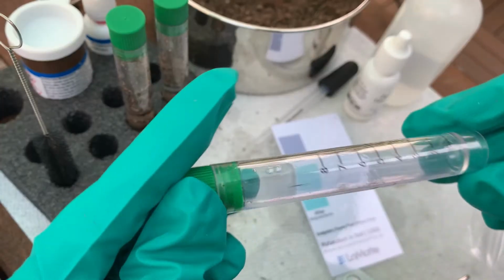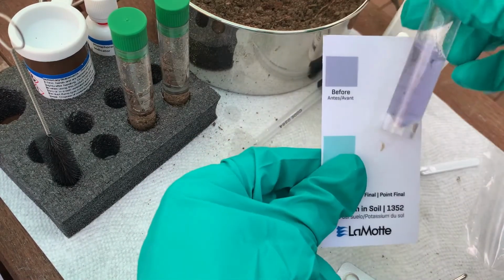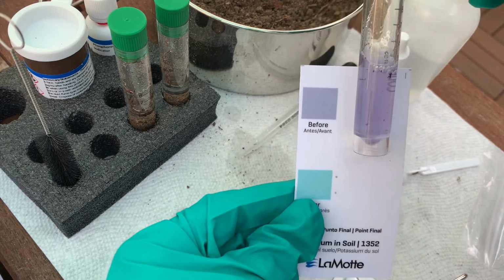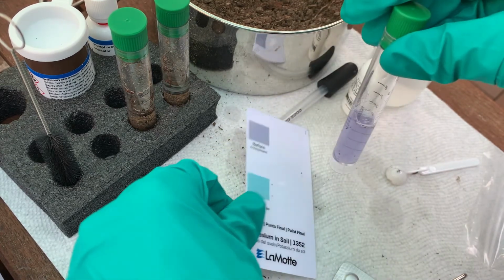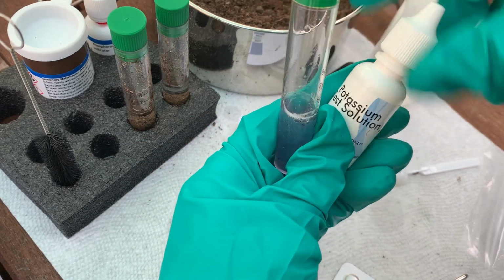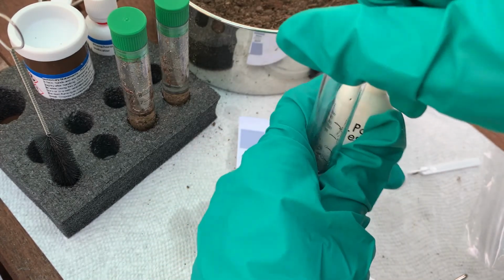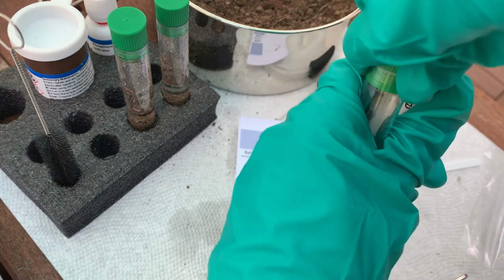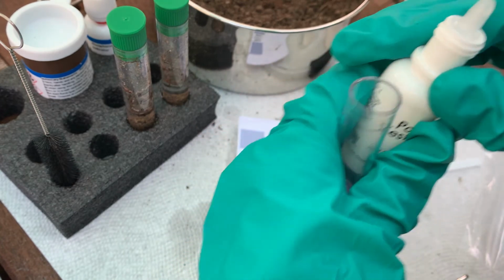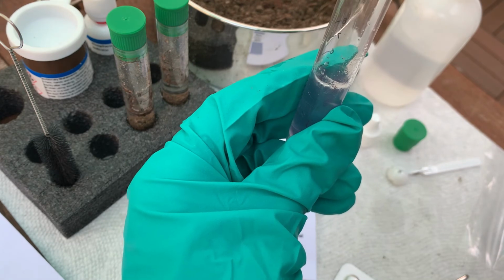Check it periodically to make sure you fully dissolved the tablet. And then take a look and make sure it is, in fact, the color that it should be. Should be purple in color. And then we're going to add the potassium test solution 2 drops at a time. But if you look at the color chart, you'll see that from 0 to 8 drops is a very high potassium level. So I just go ahead and add 8 drops in the very beginning and check that to make sure my color hasn't changed.